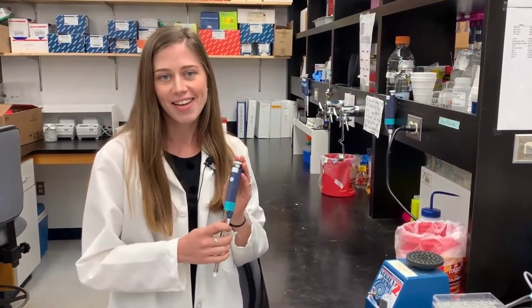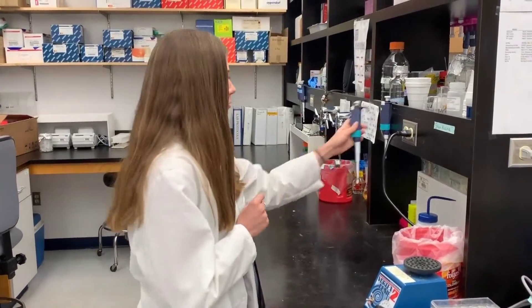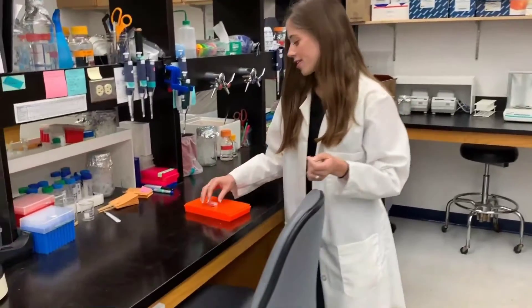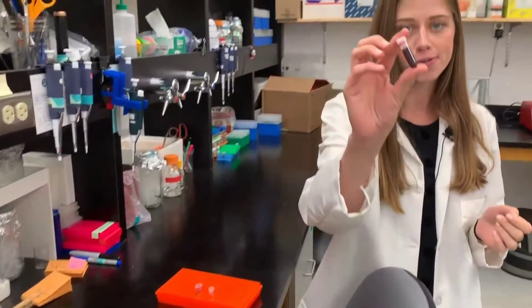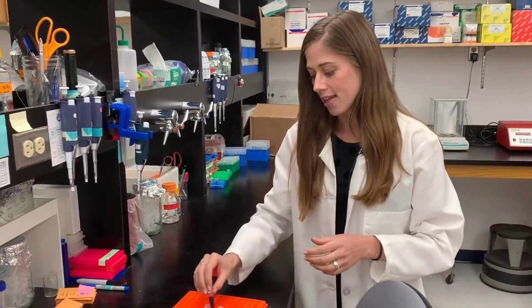Every scientist has a set of pipettes that we use to measure out really minuscule amounts of fluid that we can then put into our mini reaction centers like these Eppendorf tubes. Since we work on such a small scale in biology, that's all that's really needed for us to mix our reactions or do our experiments.